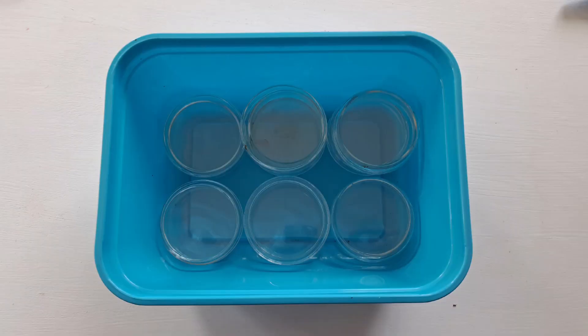Starting with agar helps me throughout the whole process because my mycelium will colonize faster and it will prevent more contaminants. Now let me talk through the supplies and show you what they look like, along with a brief explanation on why I use them. First we have our glass petri dishes. You can also buy plastic petri dishes or pre-filled petri dishes. I choose glass because they're reusable and they don't melt in the pressure cooker.